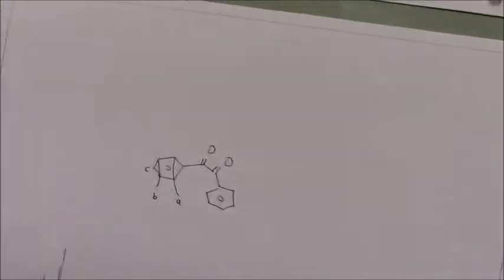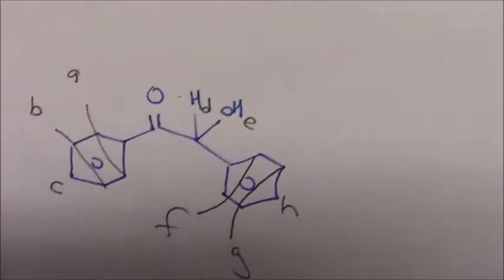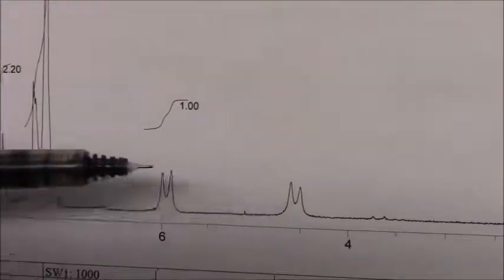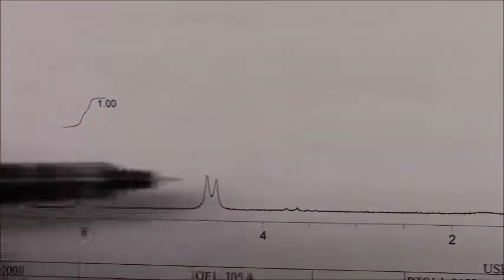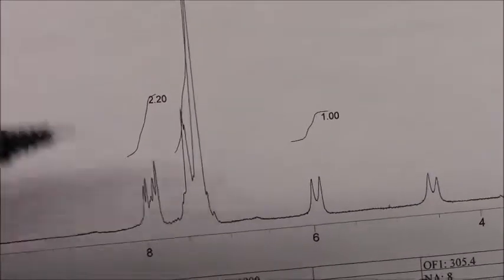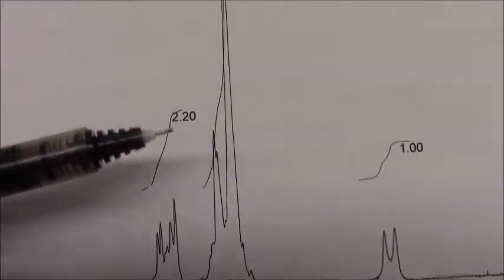We go on to NMR. We have to review the starting material. We did this the other day, but we'll do it again. So we'll start with the benzoin starting material. The H that I've labeled D is the one at 6. If it's talking to the OH, labeled E, you'll see them each be a doublet. If it's not, you just see 2 humps. So depending on the concentration, how you made yours, you'll see it that way. And we talked about this a bit. The integration here is 2 to roughly 8.